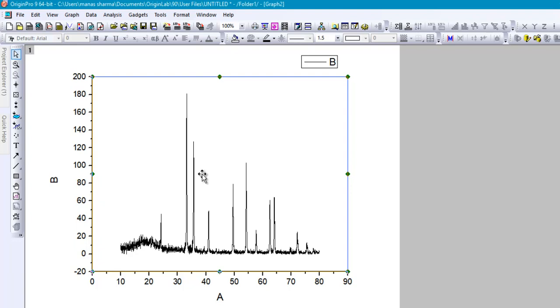Basically this software is not needed if you have been provided a software that comes with the machine. All these diffractometers come with a software that already does this task. However, sometimes when I perform this experiment in my lab, I usually forget to convert the data into the readable format. Usually I just email myself the .raw files, and in that case this software comes a lot handy for that.